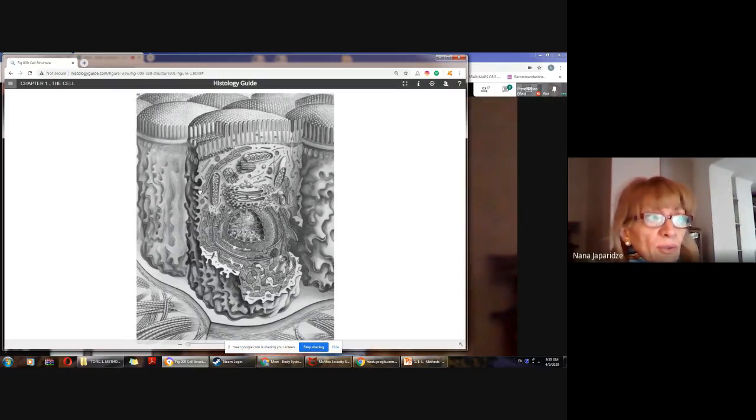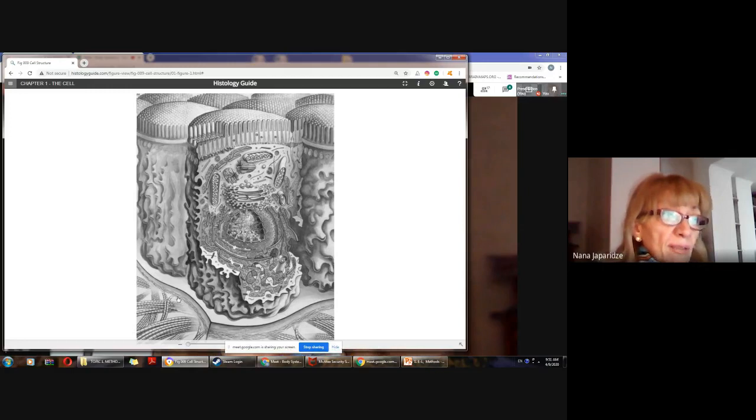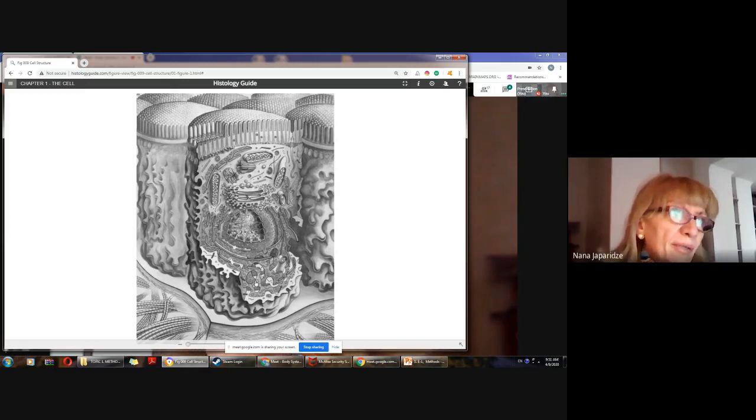And you'll see that the cell itself is located on the basement membrane. Look, this is the basement membrane, which contains different parts of extracellular matrix, and this extracellular matrix is produced by these cells themselves, and by other types of cells, I mean connective tissue cells, which usually are allocated beneath the epithelial covering.